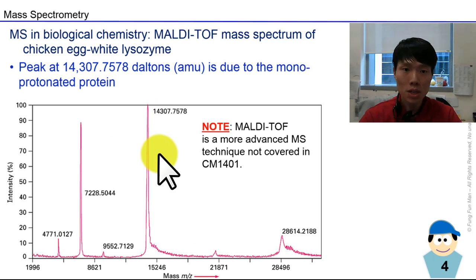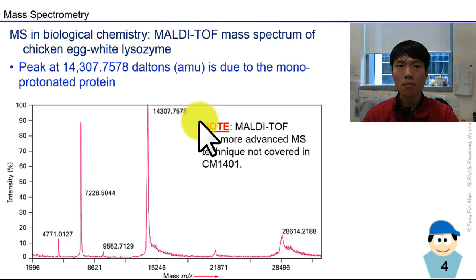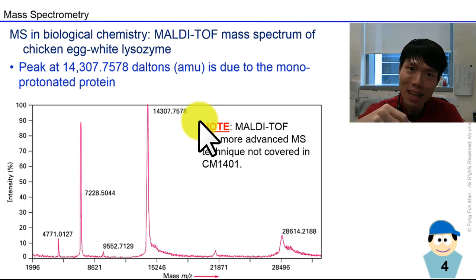Huge peaks. Look at the value here, 14 plus thousand, and it goes up to 4 decimal places. You might ask, why does it have to be so accurate? Now think of two persons. My height is 1.84 meters. If I have a good friend who's the same height, 1.84 meters, who's taller? People normally think you're the same height, but to me, I think we are different heights. So we can go down further to the centimeter level, the millimeter level, etc.